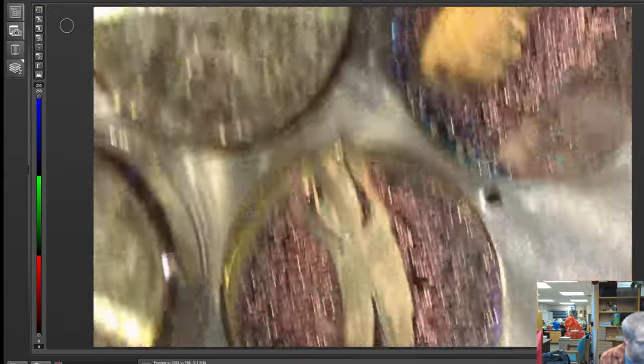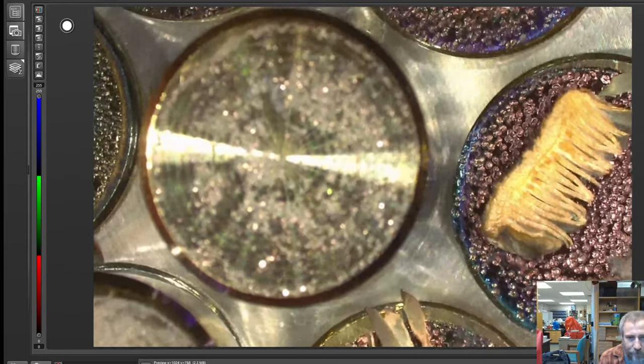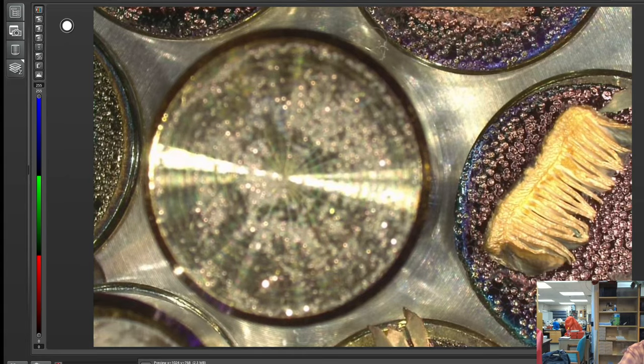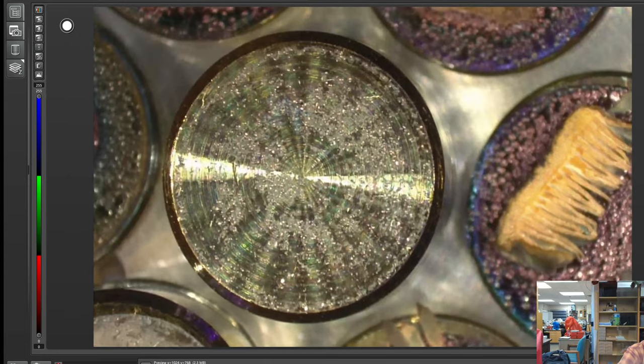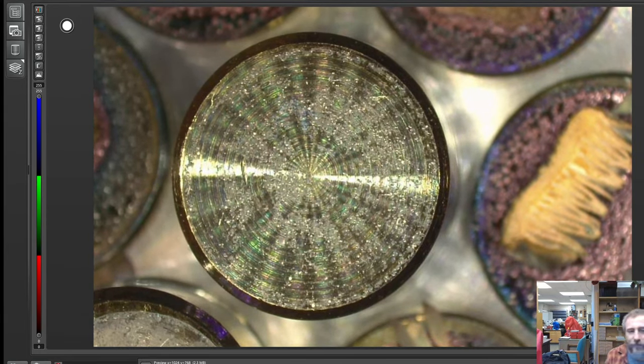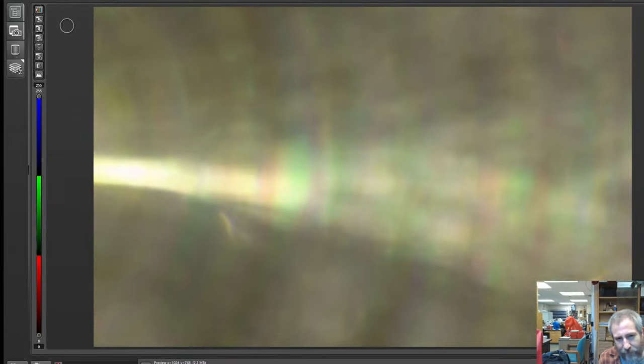And then just for some reference, we also looked at some diatoms from Pacific plankton samples, and those stubs are also still on here. They're at a much higher height, so I need to zoom up. This big circle that you're seeing is a little metal cylinder that's aluminum, and diatoms are on there, gold-plated, and dried onto the surface of that.